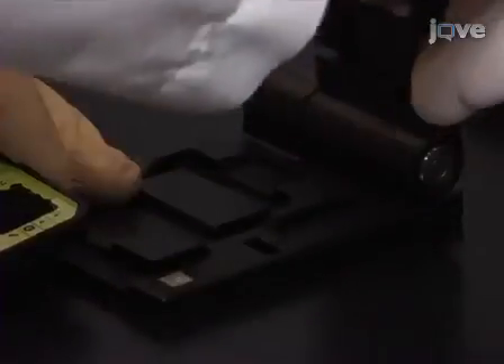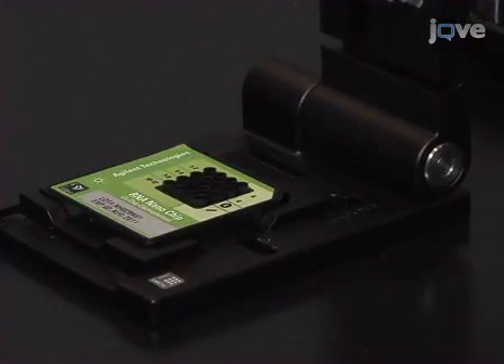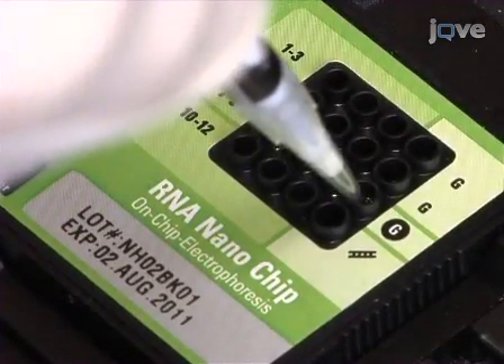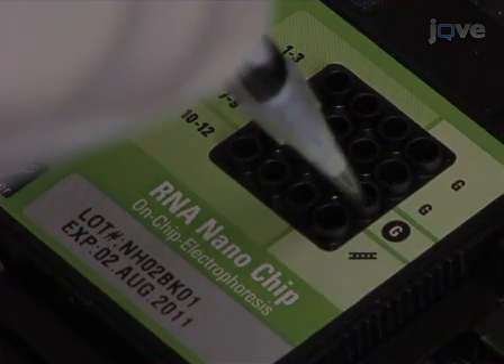To run the samples, first position a chip on the priming station. In this demonstration, RNA 6000 nanochips are used. Load 9 microlitres of the gel-dye mix in the well marked with a white G against the black background, with the pipette tip positioned at the very bottom of the well.